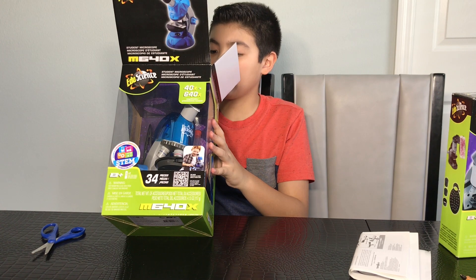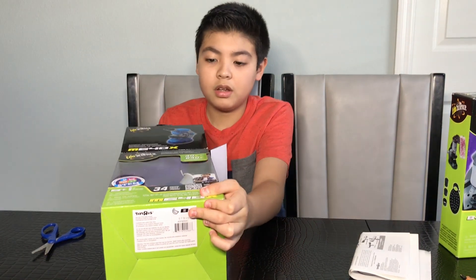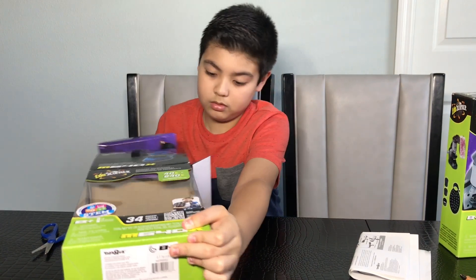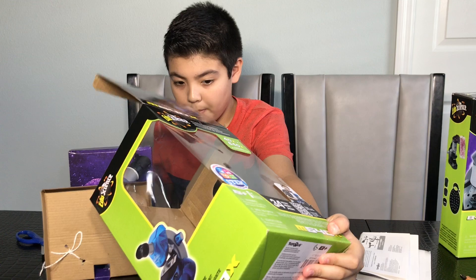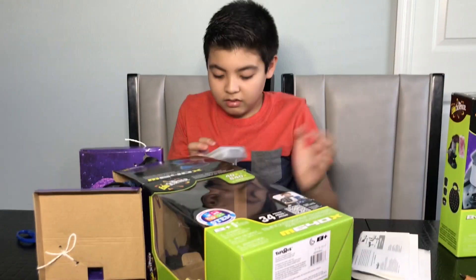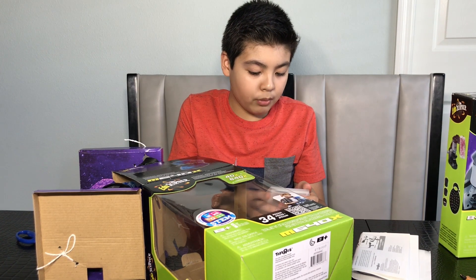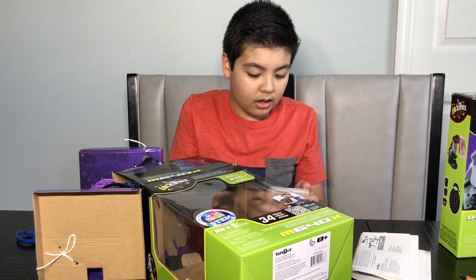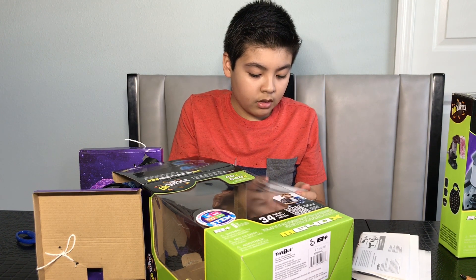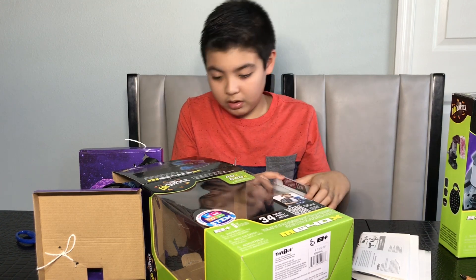There's a shrimp hatchery slicer with any instructions below. This thing looks nice. Our slides are right here. These slides — we have one prepared slide. You got eight of them in labels and colors. So these are where we keep the slides and there's a couple of prepared ones.